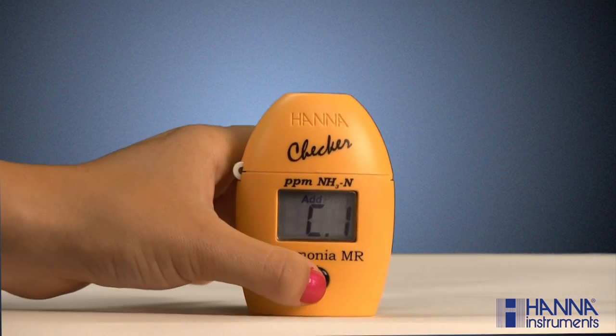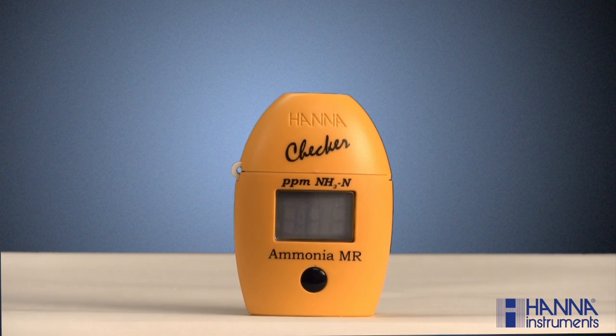Press the button. The meter is now determining our blank value, which is the absorbance from our unreacted sample. This is done to correct for any absorbance which may be inherently present in the sample. When C2/add appears with 'press' blinking in the right-hand corner, the sample has been successfully zeroed.